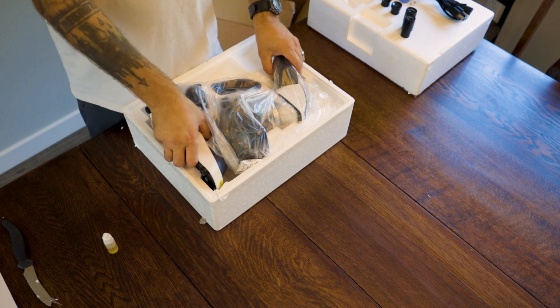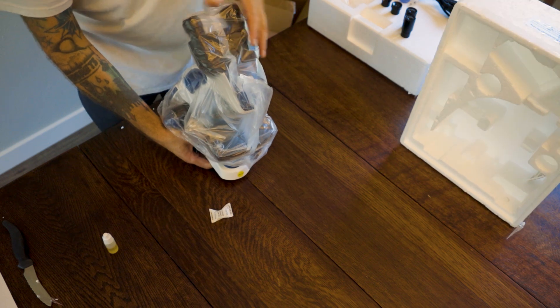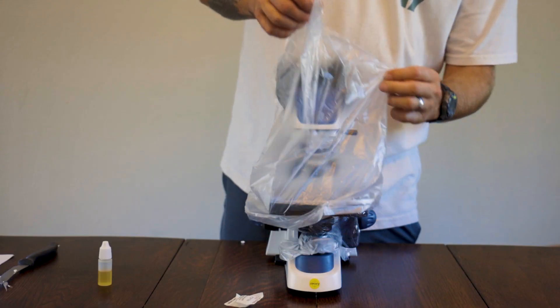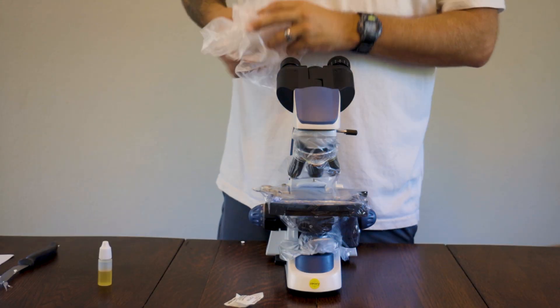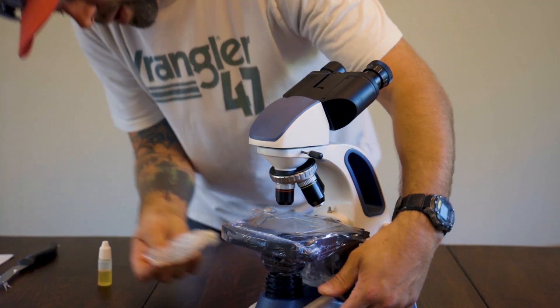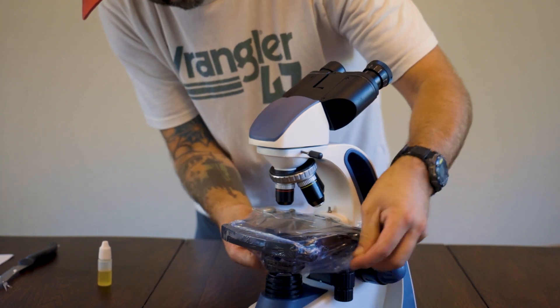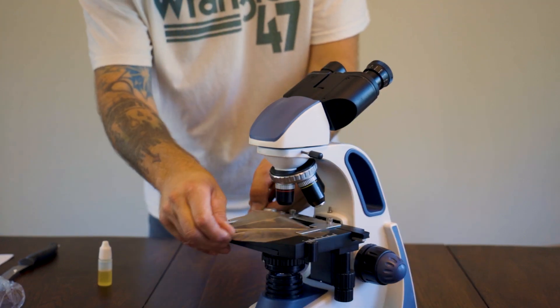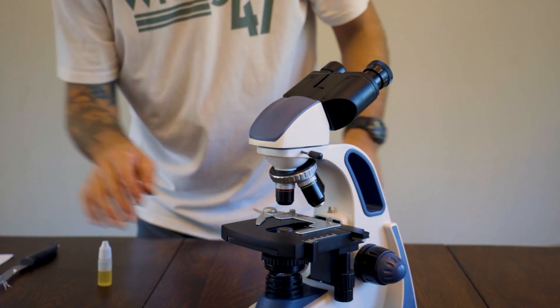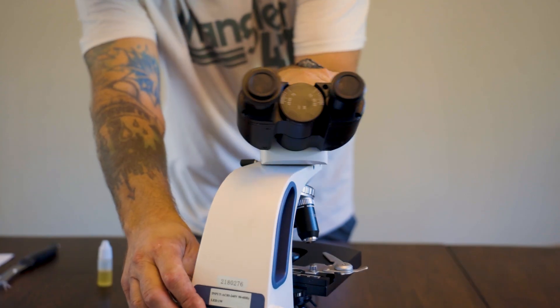And now, for the microscope itself. Get all that wrapping out of the way — and there she is. Look at that. The head swivels.